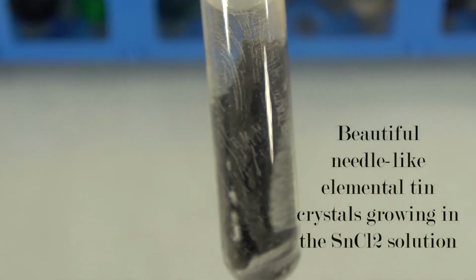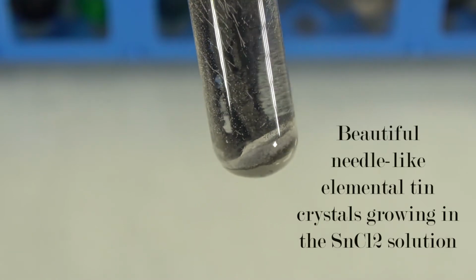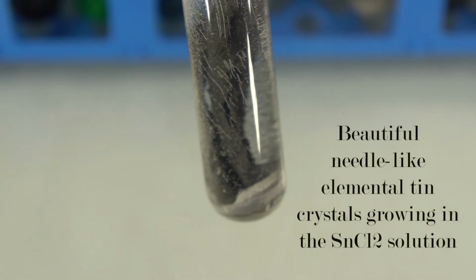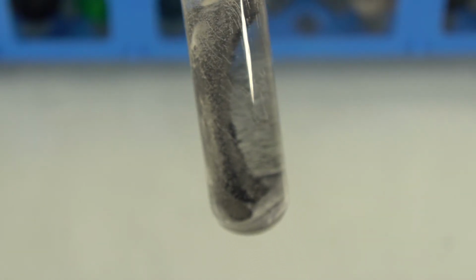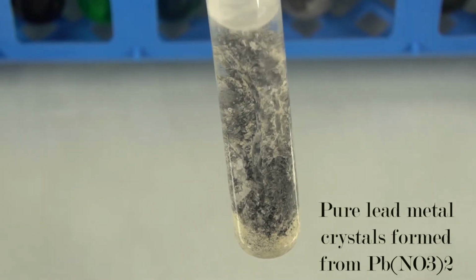Elemental tin crystals were formed in the tin(II) chloride solution, and you can see the beautiful tin needle crystals in the tube. But in our opinion, the most beautiful result was the elemental lead crystals that looked like a glistening geode filling the test tube. And here you go, you can see the lead.